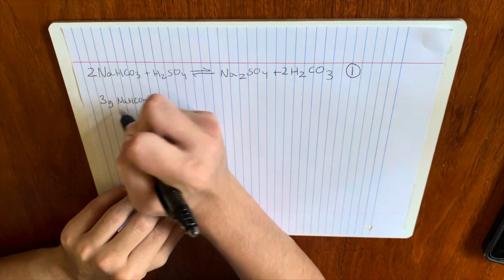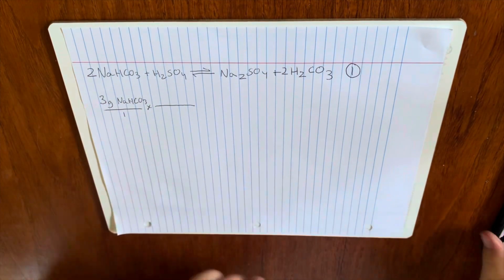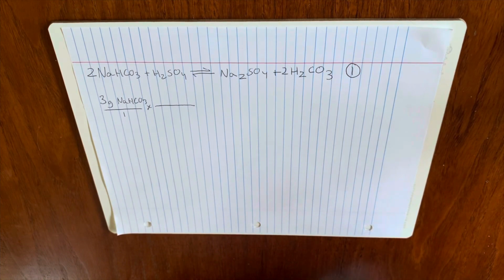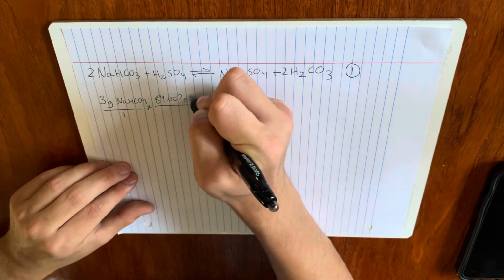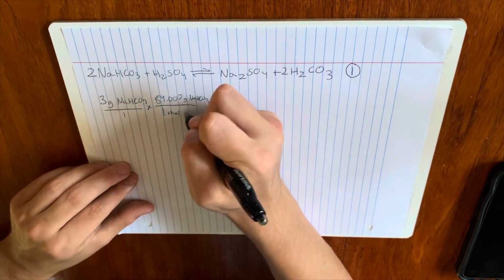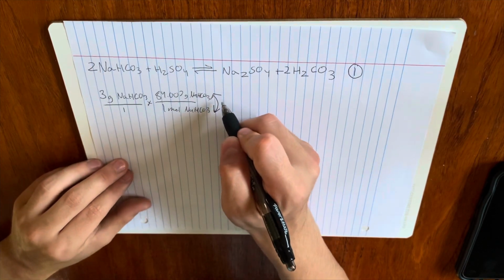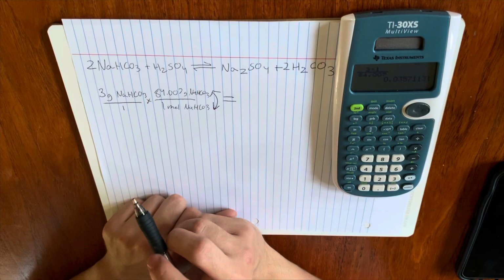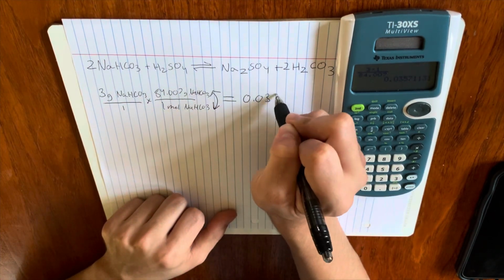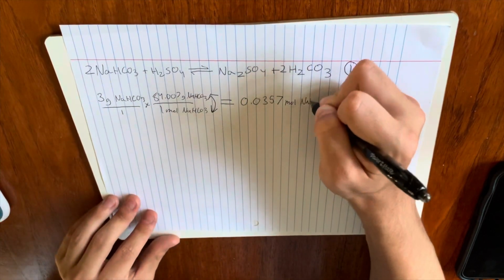Earlier, when we measured out our baking soda mass, we got about 3 grams. This is then corresponded to a mole ratio for sodium bicarbonate to determine how many moles of sodium bicarbonate are in our solution. As you can see here, I messed it up a little, so I draw some arrows showing that it's actually reversed. Just use a calculator to calculate this. We're going to round to 3 significant figures here. 3 or 4 should be fine.